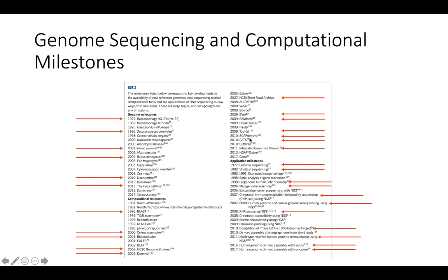This one I'm sure, I know that it's a suite of software developed by the Broad Institute of Harvard and MIT to allow, I have used it for identification of SNPs using sequences from the SRA, from the Short Read Archive. And then the Integrative Genomics Viewer, I think I'll mention this again when I show to you the deliverables from each of your groups.